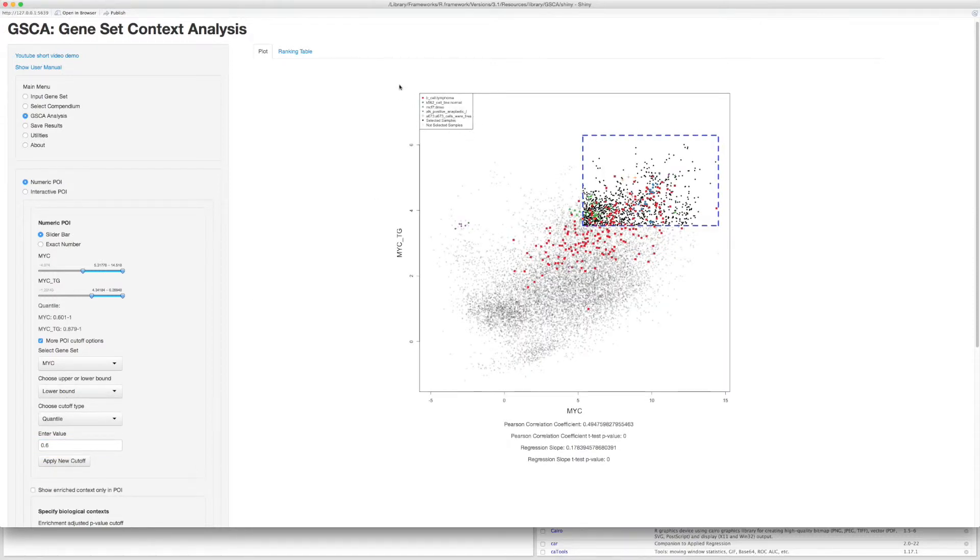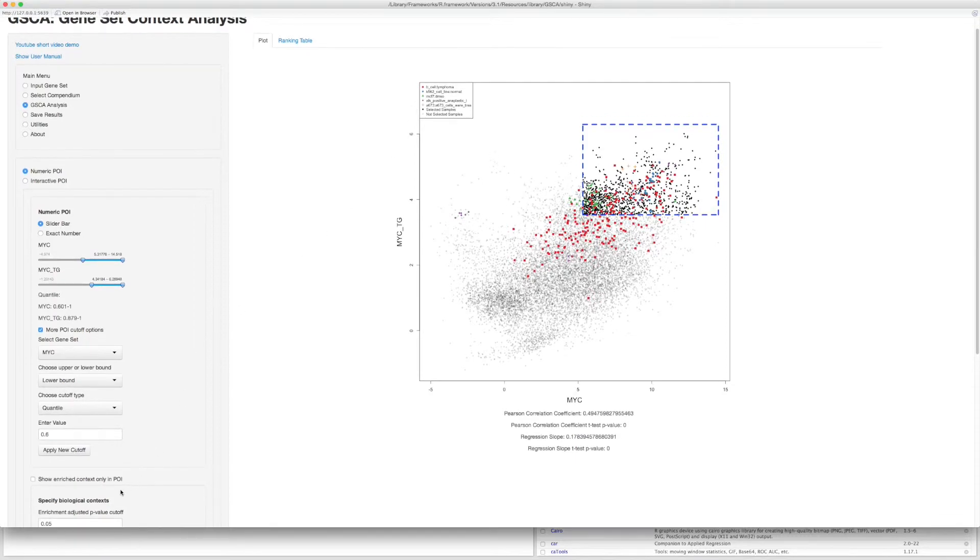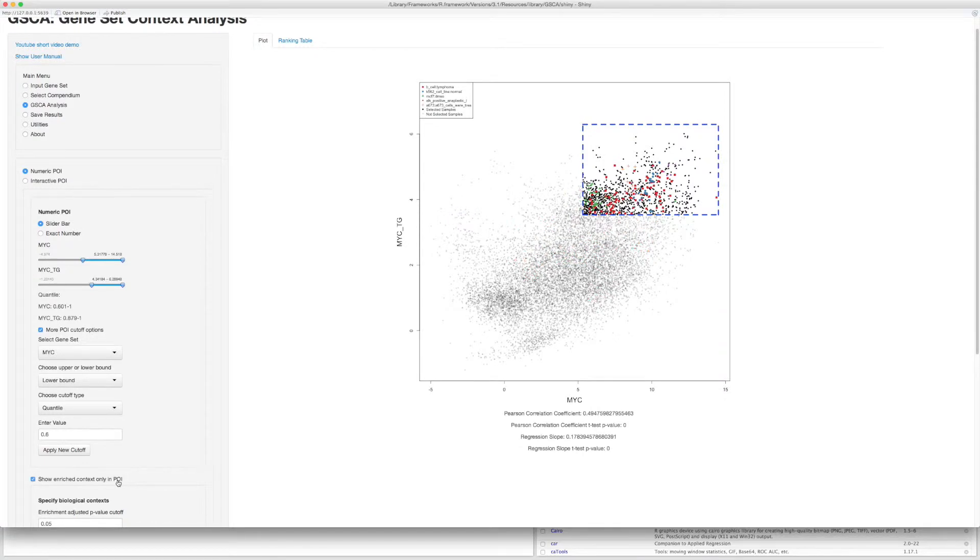The legend shows the top-ranked enriched biological contexts associated with high expressions in both gene sets. Check these options here if you want to show enriched biological contexts only in POI.